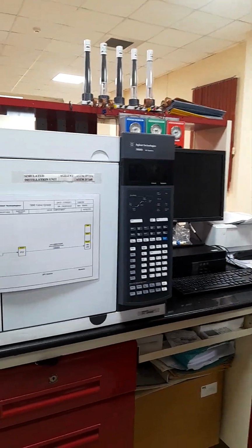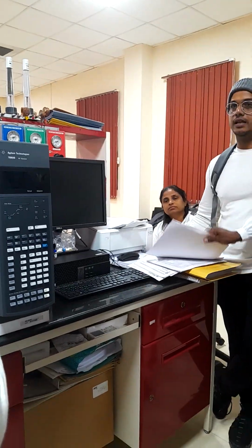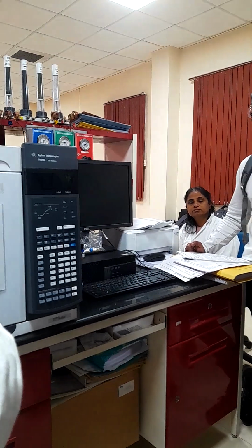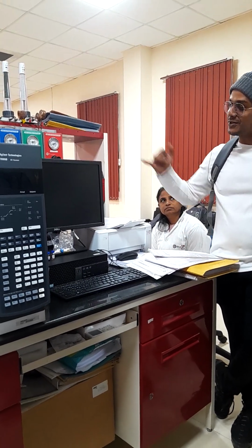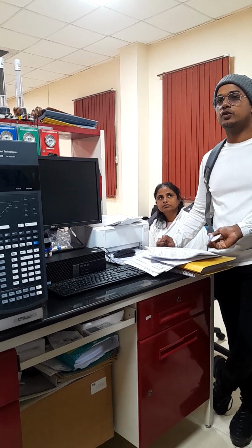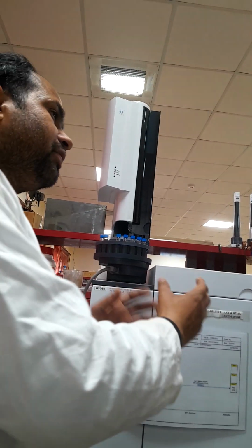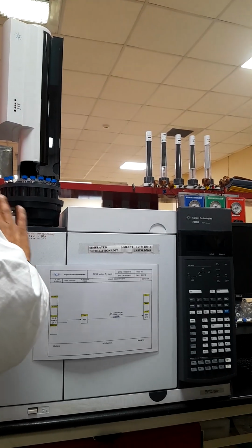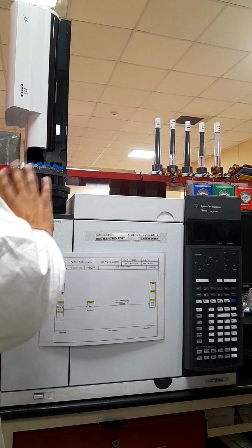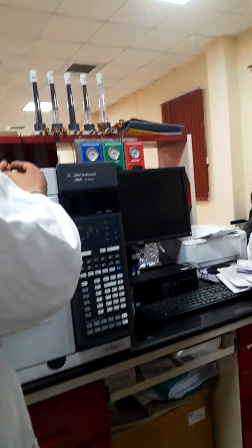Because with the FID, it's a combination of air and hydrogen to burn, and based on this I would assume that you'd want your carrier gas to be inert. Air will come with the sample to the detector point. It will go through the column up to the detector.